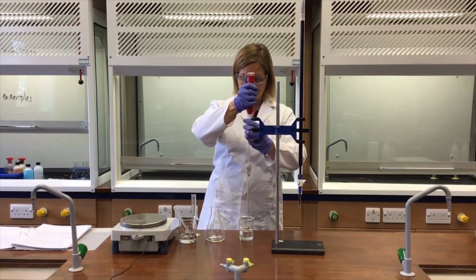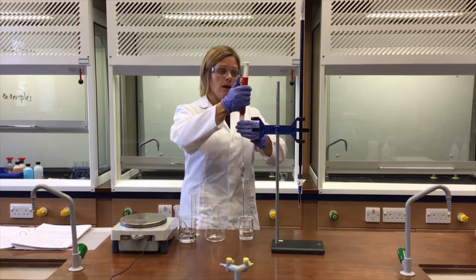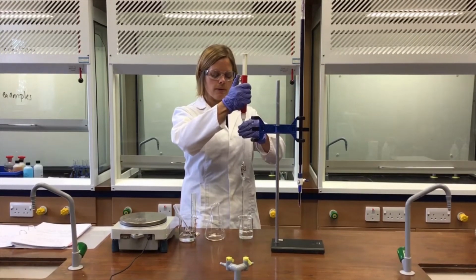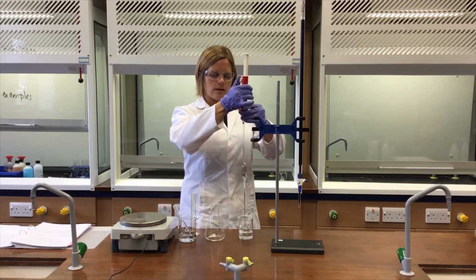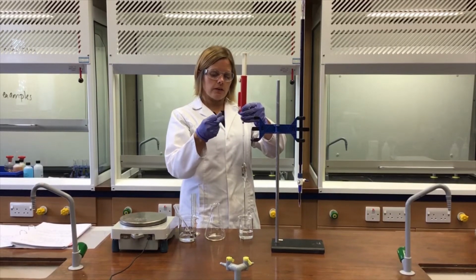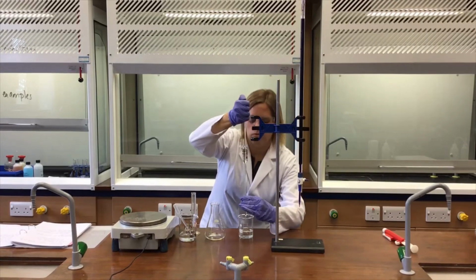There's not a massive chemical reason to wear the gloves in terms of chemical hazards specifically, but this stuff here is a bit messy, and if it gets on your skin, it does stain your skin for a few days, so I usually recommend just wearing a pair of gloves just to avoid that stained skin. It does, however, make this bit a bit more tricky with the pipetting. So I'm going to just make sure that the glove's nice and tight on my thumb, push up, switch that filler, and then it's back to normal.